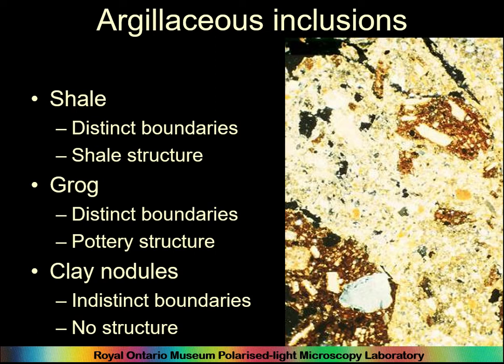If you remember that slide a couple of slides back of two different basically piles of clay being put together to make a workable paste, you can imagine that if that's not mixed very well, and milling clays to make a very fine-grained material is not common in the ancient world, it will have lumps of the different raw materials which have been processed.